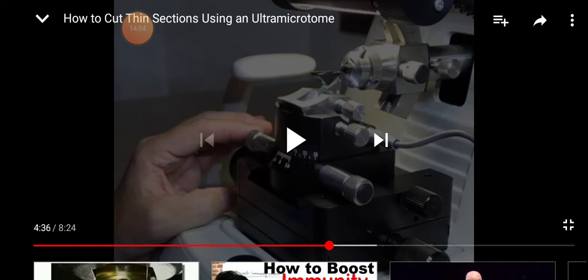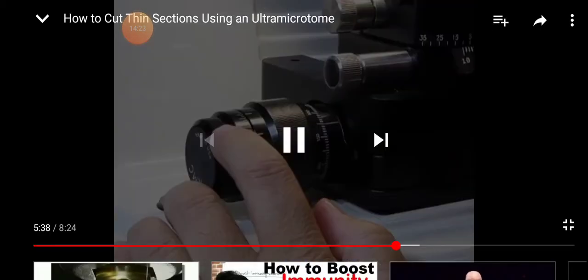Okay, after all the adjustments are done, and after all the setting of the instrument, then we put it in the automatic mode. Position it so that we're not accidentally going to hit some other place of the block. Approach slowly and carefully. Use the stage.